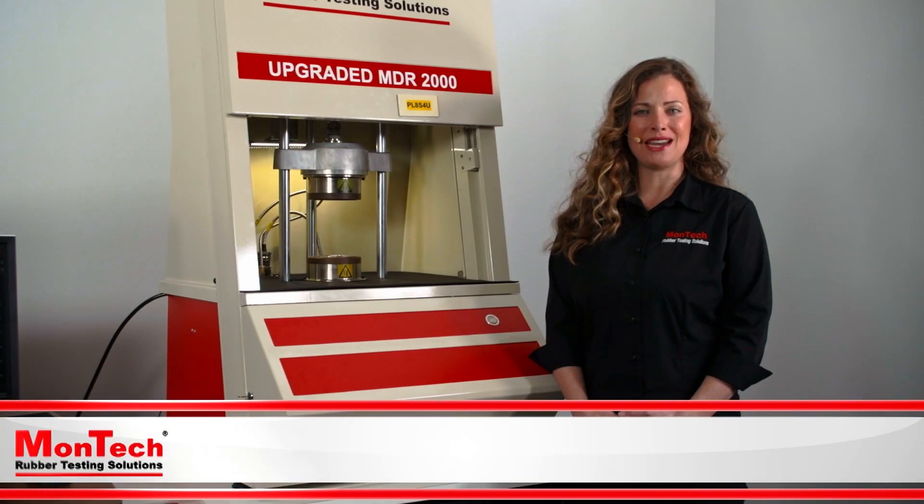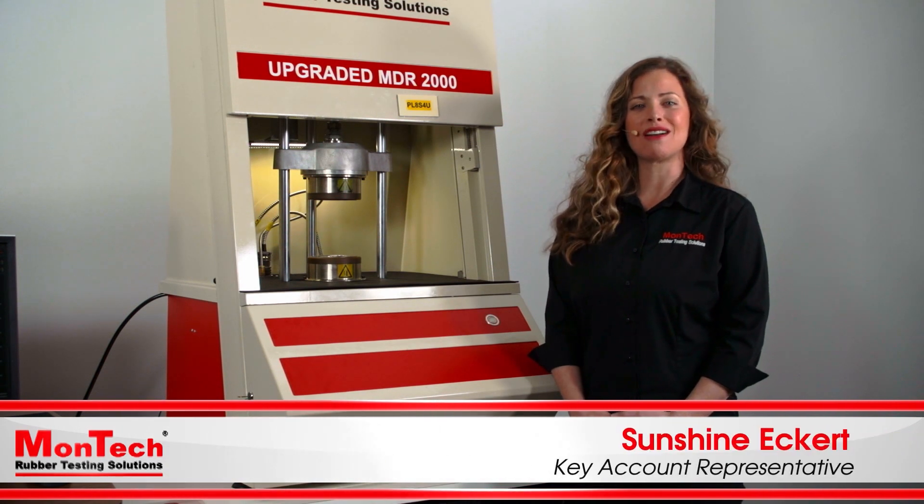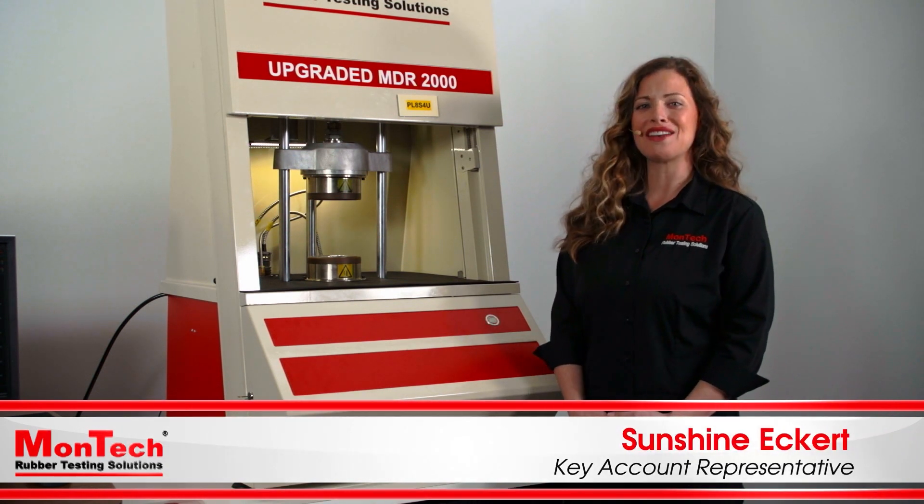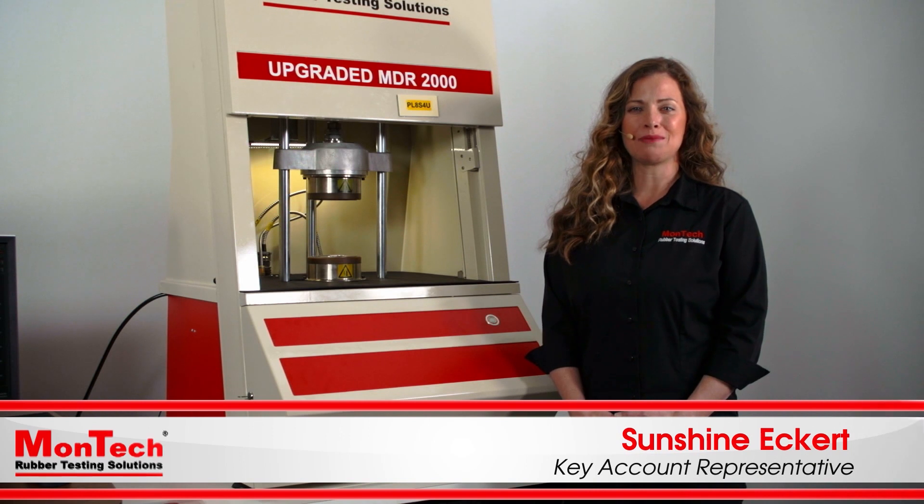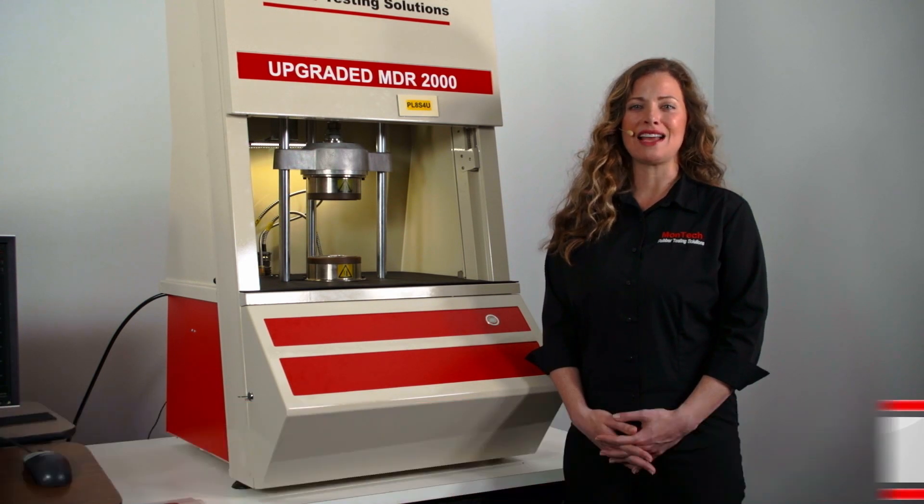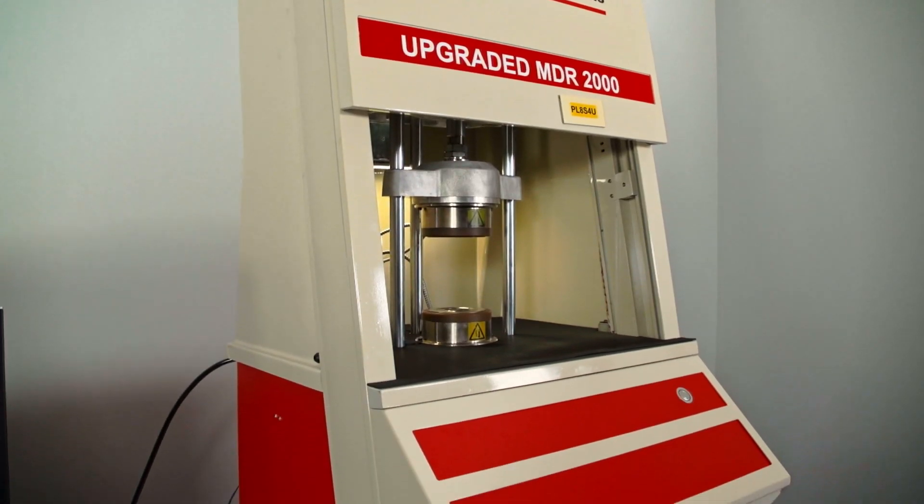Montex MDR 2000 upgrade is the complete rebuild performed in our ISO 9001 certified facility. We completely disassemble the machine, glass bead blast the frame, and repaint inside and out.